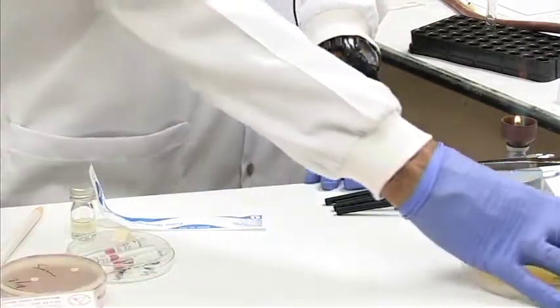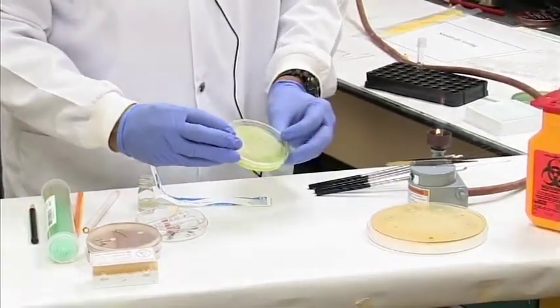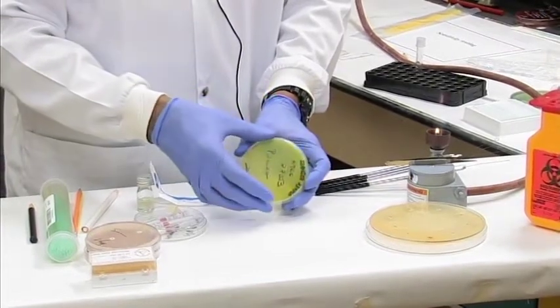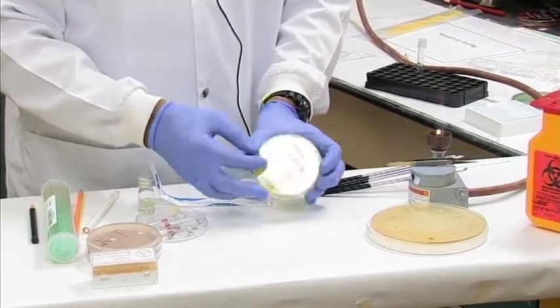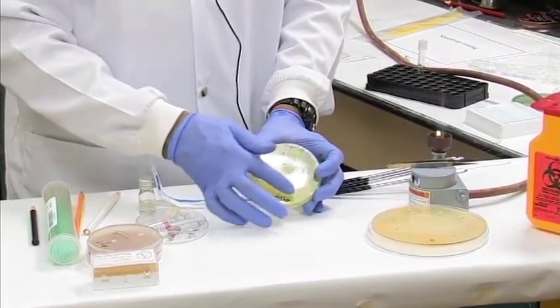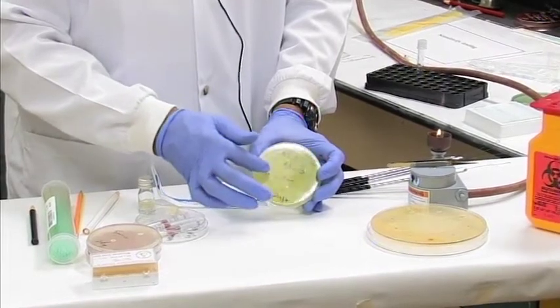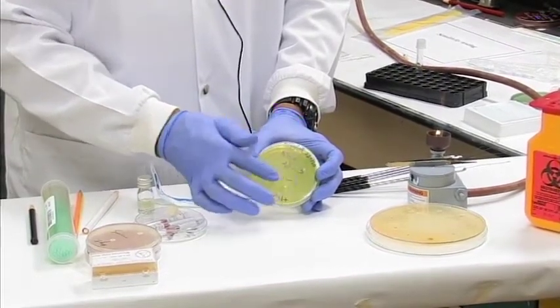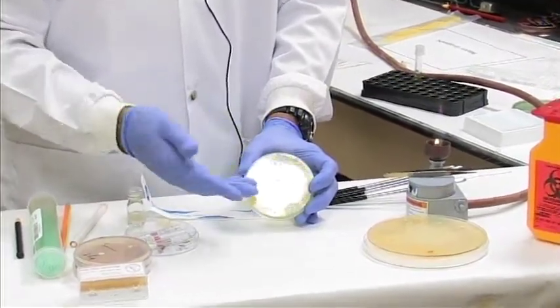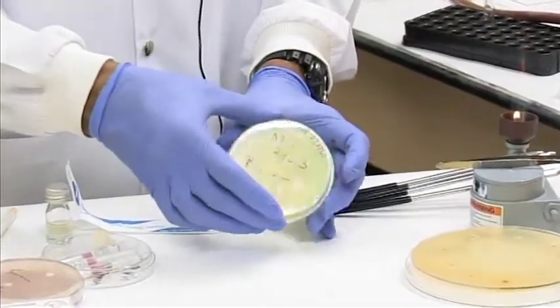After that day has passed, we'll remove our plates, and we should get something like this here. This is a small sensitivity plate with Pseudomonas aeruginosa. Pseudomonas aeruginosa produces what they call growth pigments. Some of these pigments, for example, might be pyocyanin, pyorubin, pyoverdin. So you have yellow, green, pyorubin might be red, and so on. So this bacteria actually shows different colors.